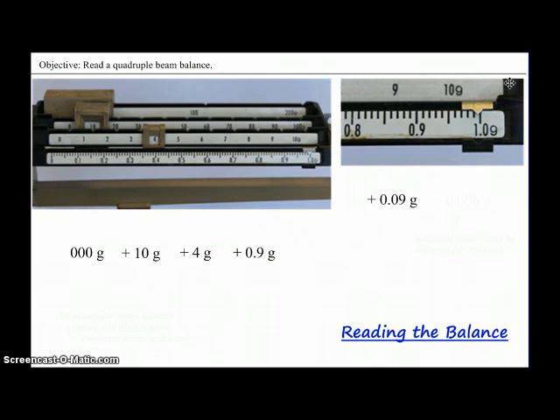Now we're going to estimate the space between the two lines of our final reading. So we mentally divide that space up into 10 places, and then we guess where our reading is going to be. So when I look at that white space and I see where the point is pointing, I'm going to say that it's about 6 tenths of the way over, giving us a reading of 0.006 grams.